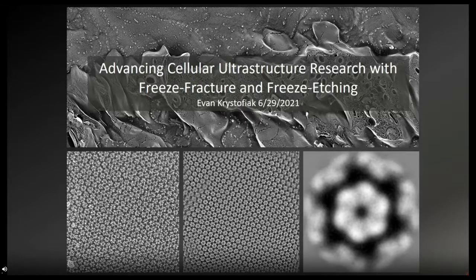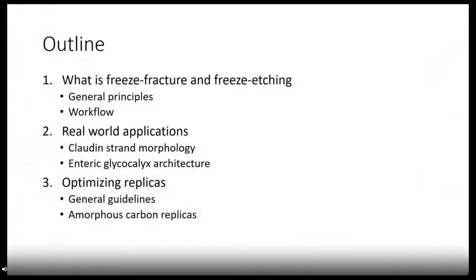Today I'd like to tell you about a technique near and dear to my heart, freeze fracture and freeze etching. This talk will be broken down into three parts. First part is a general overview of freeze fracture and freeze etching, going over the general principles, when you would use freeze fracture, when you would use freeze etching, and the workflow involved in producing these replicas.